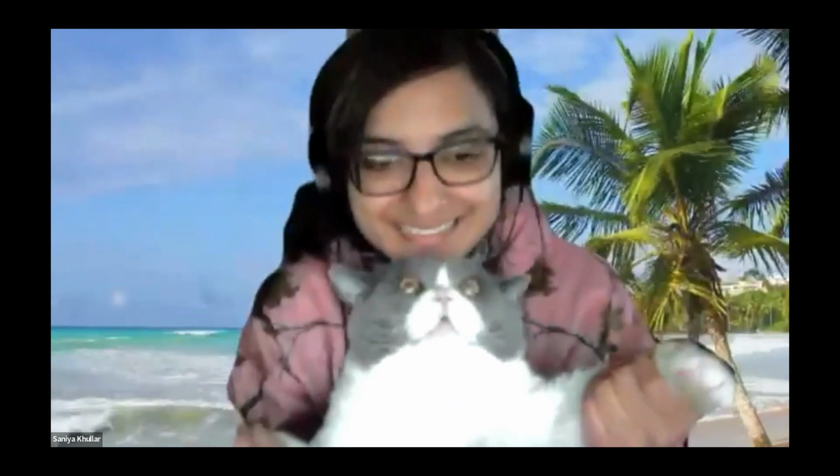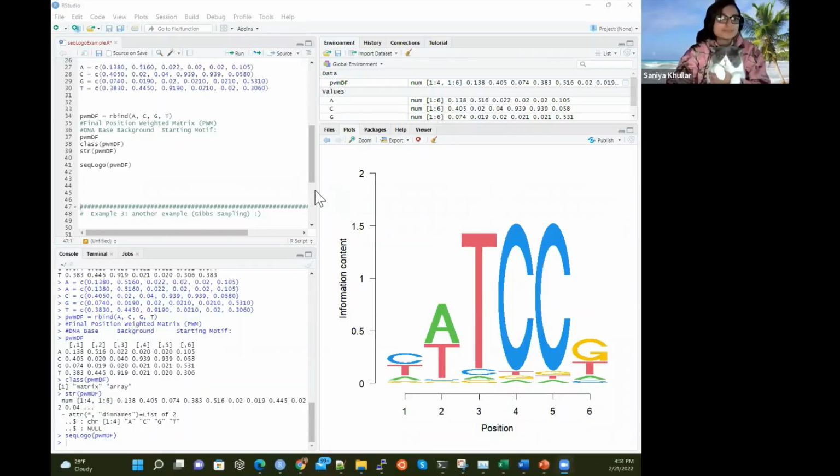So Yankey's excited because now we can view these results. He wants to close his eyes till I guarantee that the logo comes out right. Let me check. Actually, Yankee, I think it's fine. You can open your eyes and see. So let's see what a beautiful logo we hopefully will have.